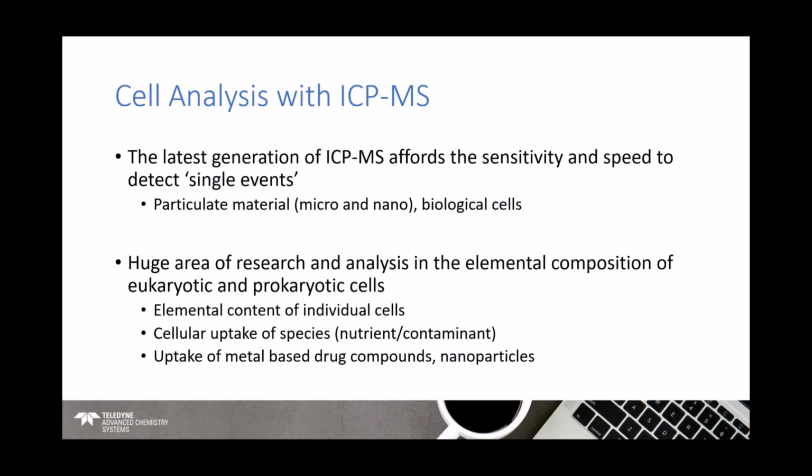We could be interested in cellular uptake, so species which are of a nutrient origin, or species in cells which are present from a contaminant point of view, or cells involved in metal-based drug uptake, so compound uptake studies, or nanoparticle uptake.